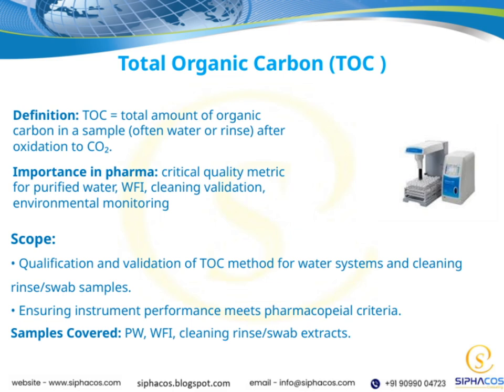Now let's clarify what TOC is. Total Organic Carbon, or TOC, measures the total amount of organic carbon present in a sample after it has been oxidized to carbon dioxide. It's a key indicator of organic contamination, especially in water systems. In the context of pharmaceutical manufacturing, TOC is a critical quality metric.